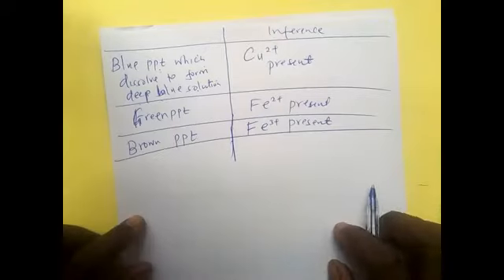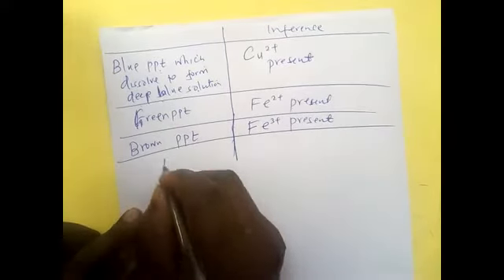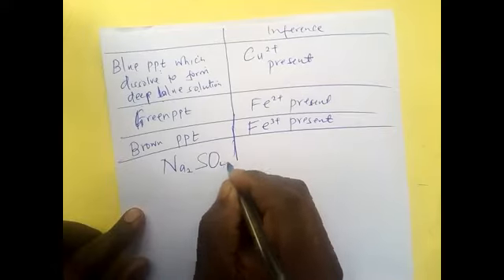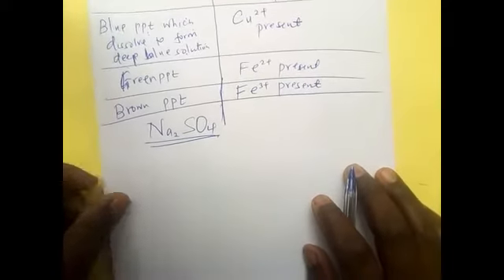So let us go to another reagent, when we use sodium sulfate. What is sodium sulfate testing?